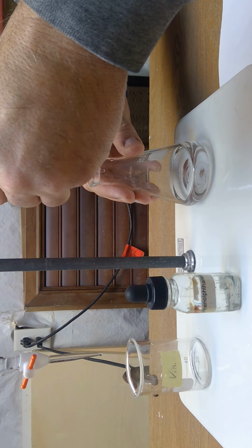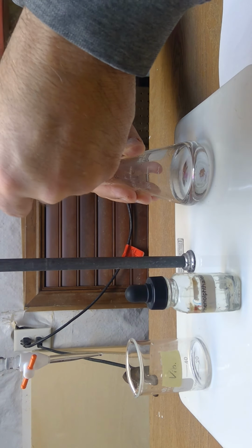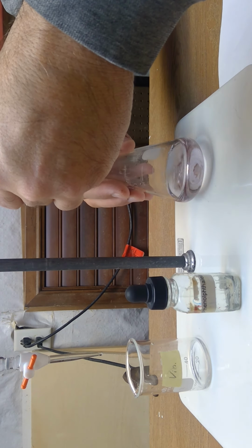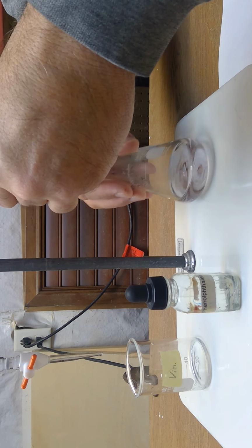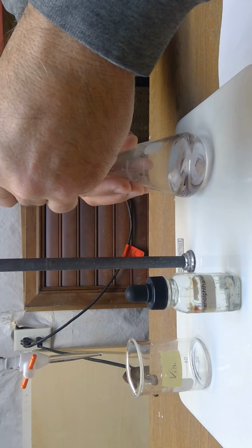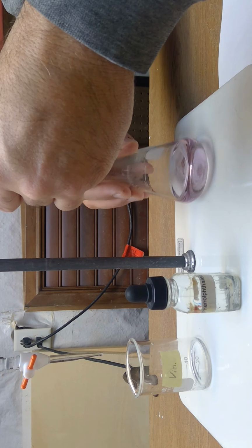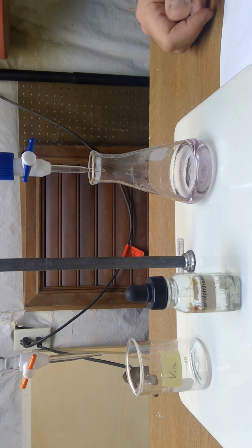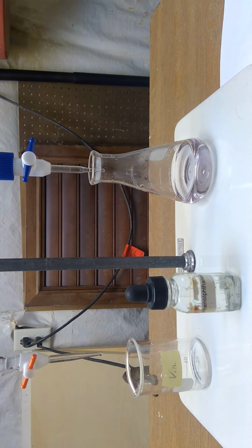Maybe one more drop. Afraid a drop is gonna be too much, but we'll see. And that's staying a very, very light color pink. So let's go ahead and go with that. All right, it's very light. It's like perfect. That's where we want to be.